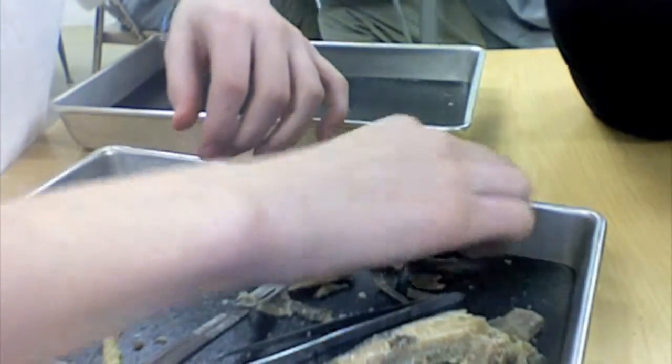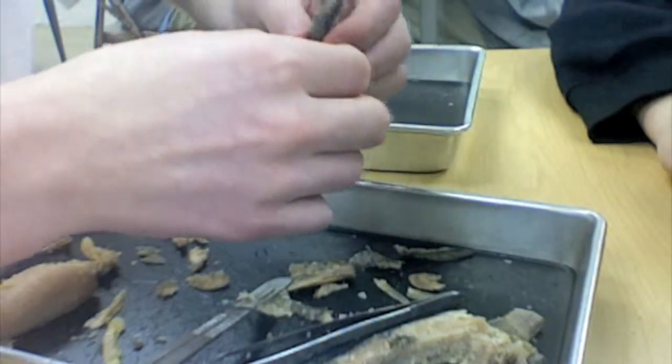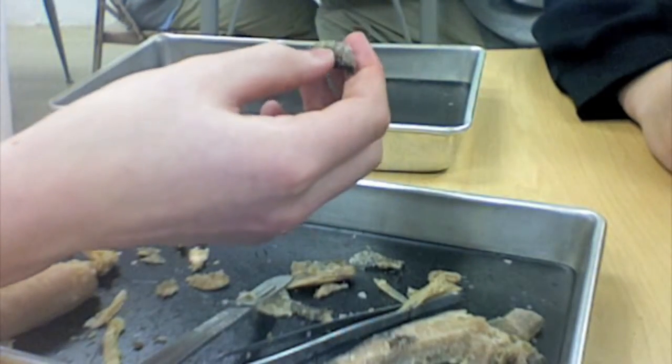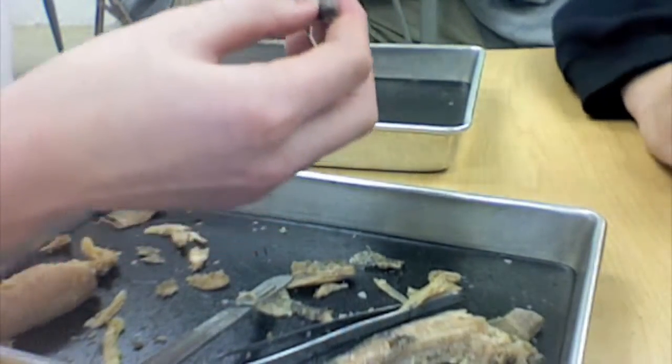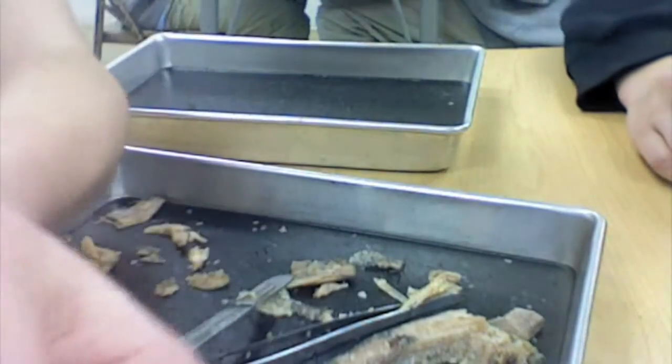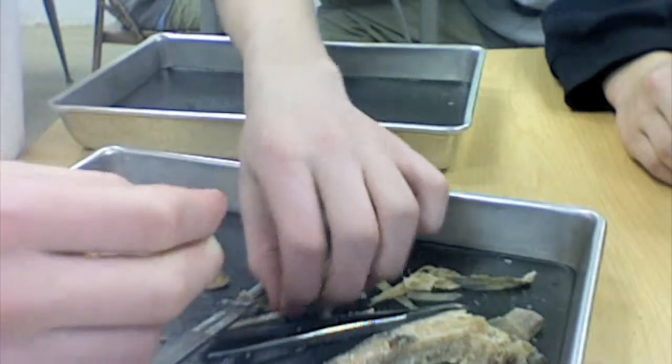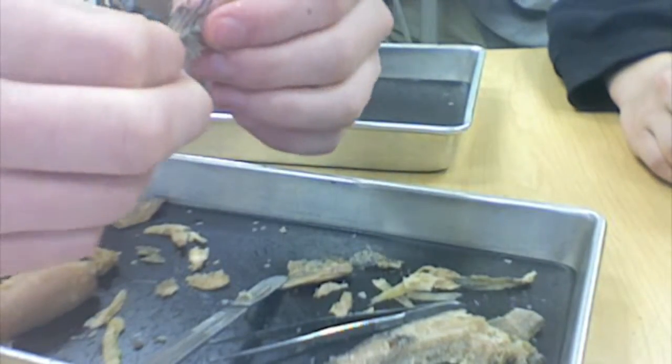Those are pelvic fins I just showed you. Yeah, those are pelvic. The things I'm about to show you are dorsal one and two. The first one is two — it's smaller than the first. Not really spiky, still spines but not sharp. There's the first one. I get poked by it.